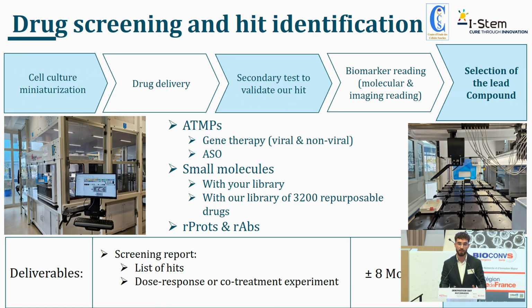We are using an acoustic handling device called ECHO that allows us to use only nanoliters to treat the cells, and also to do dose response and co-treatment experiments.